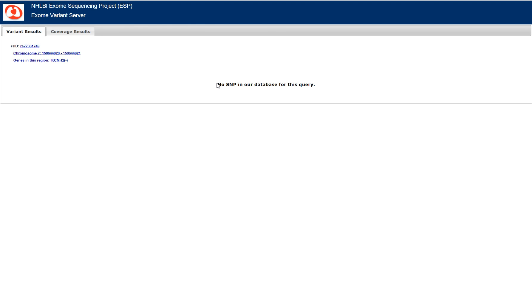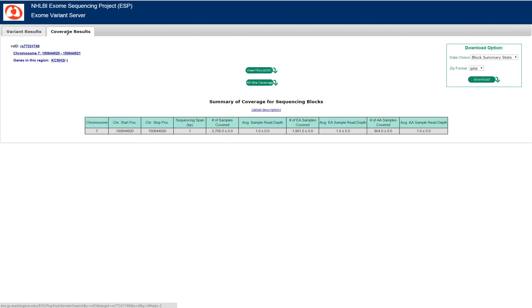This is consistent with what we saw in EXAC. There's no SNP in their database, and the interesting thing is you can see why by clicking on the coverage results. It tells you the chromosome, chromosome position, number of base pairs, obviously it's one, and the number of samples that were covered in the EVS.